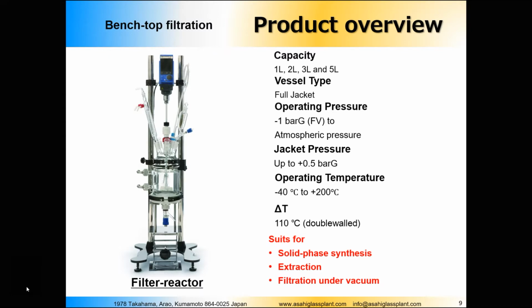So it means that when, for example, you have a double-walled or single-jacketed reactor, and you have a temperature of, let's say, 20 degrees inside the reactor, the reaction mixture, the temperature of the heat transfer fluid which you inject into the jacket can be either minus 30, that's the lowest temperature, or plus 70. So in this case we keep the delta T of 50 degrees in both directions.